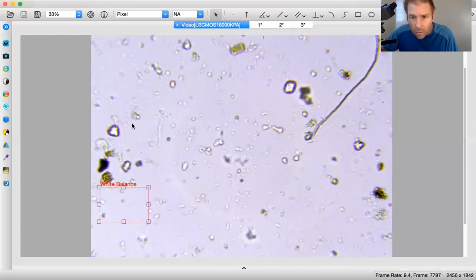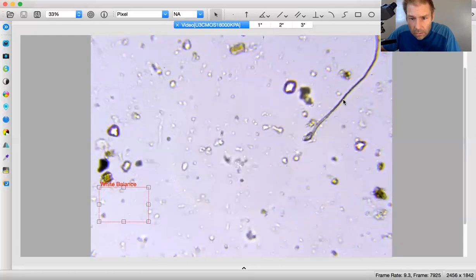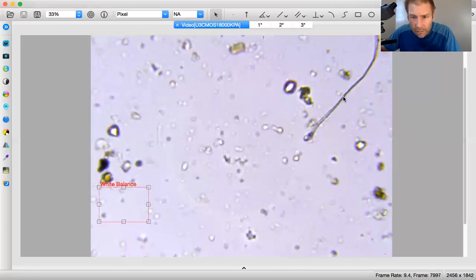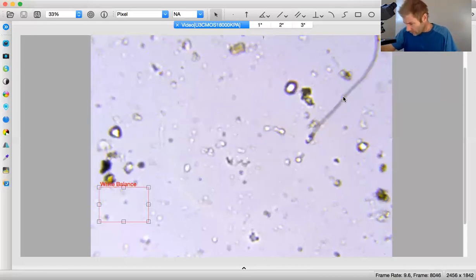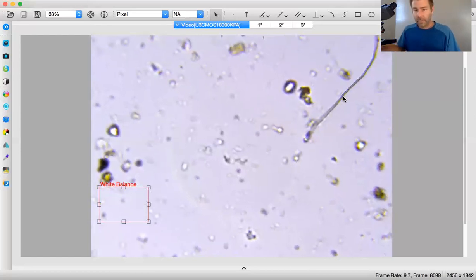Yeah, I think based on these bacteria here, there's a smaller one here. Where is it? It was here. Yeah, there's a real small one, and that could be 2 if I use that one. But that's a small fungi, and my readings have been a little fat, so we're going to go with 1.5. And that is 1.5 micrometers in diameter.